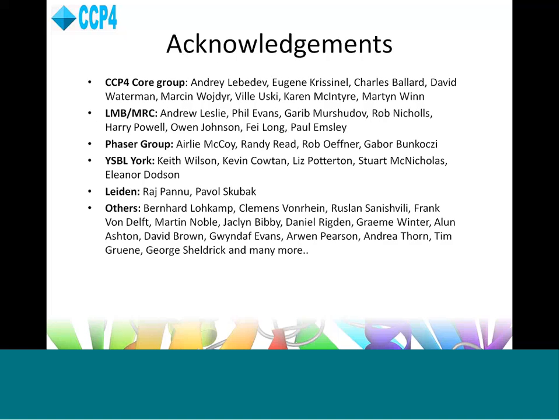We've nothing specifically in the suite at the moment, but we are working with the PDB-REDO people in the Netherlands, and they have a lot of tools for validation and checking things, and some of that stuff will be going into the suite in the near future. I mean, that's slightly outside of our area, but we will have that stuff soon.